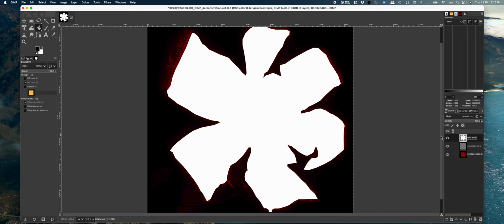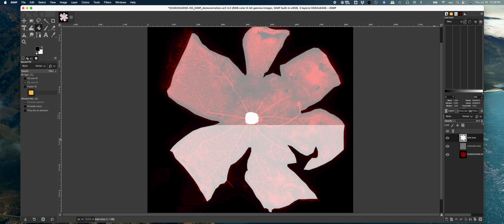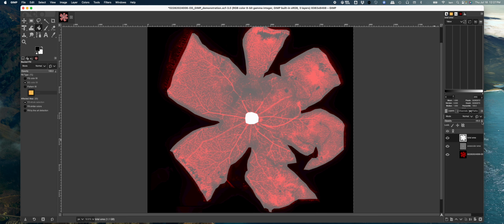And another trick you could do is, while I'm on this total area, on any area of a picture, and it's the same in Photoshop, usually you can go up and adjust the opacity right away. So if I just turn down the opacity of the total area, you can even go down to almost like 10%. I can turn it back up at any time, but I'm going to save it this way.